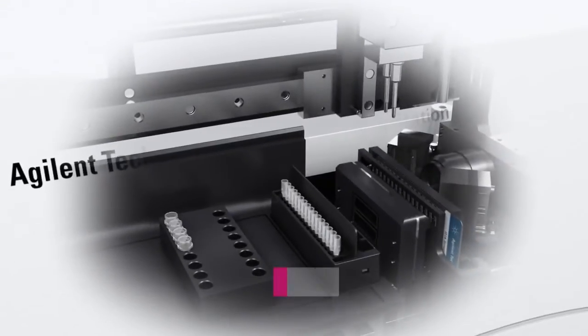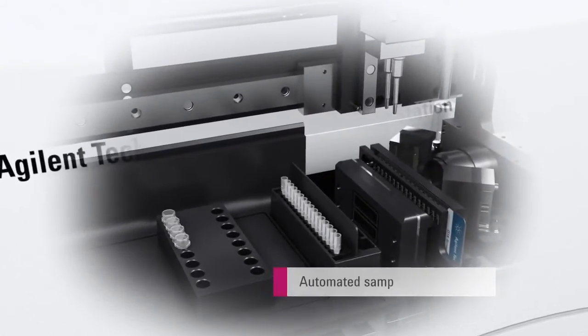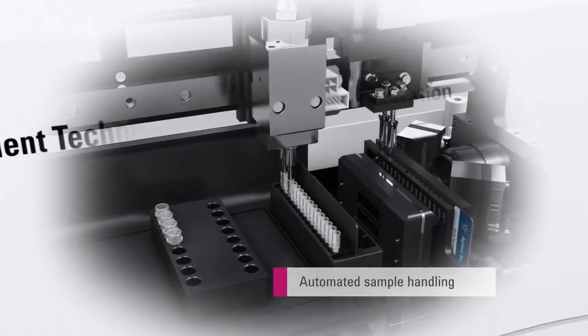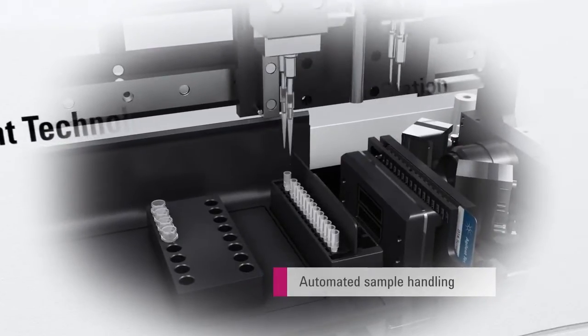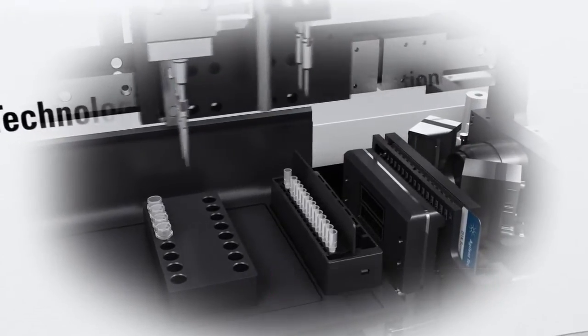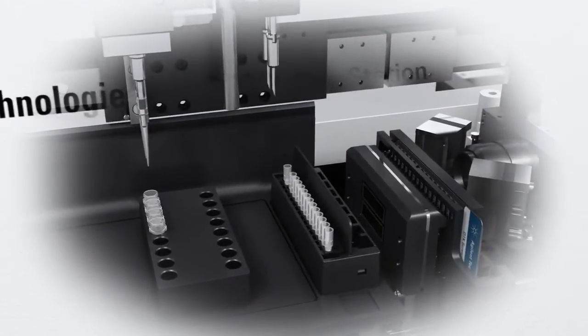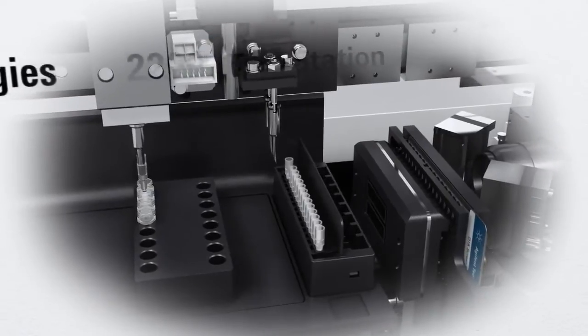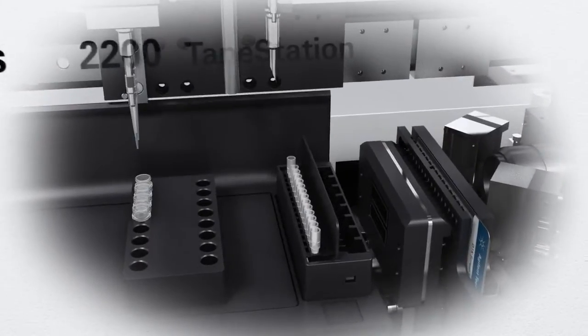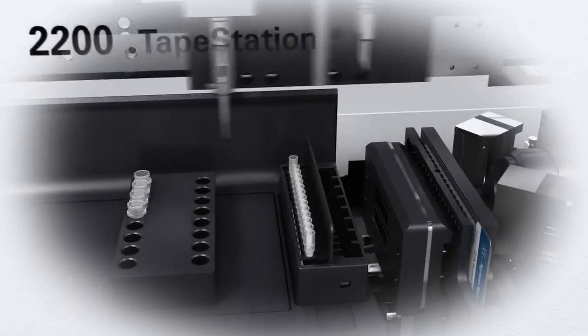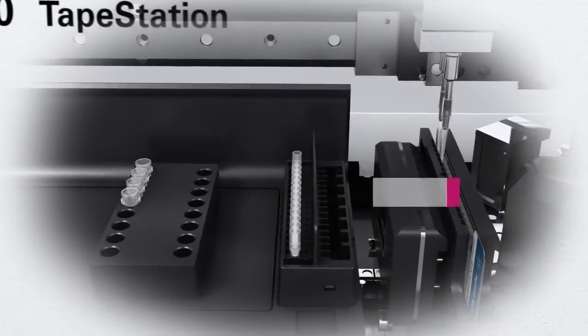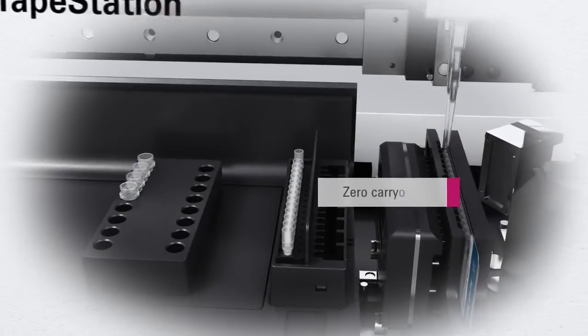Robotic sample handling with no error-prone manual steps means excellent result reproducibility can be achieved. Each sample is run in a separate lane on the screen tape, eliminating cross-contamination and sample carryover.